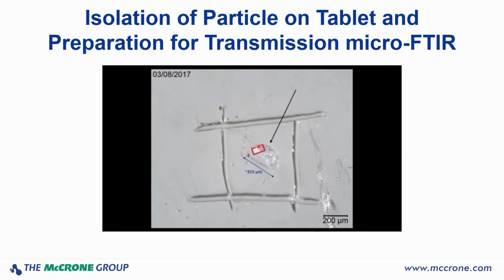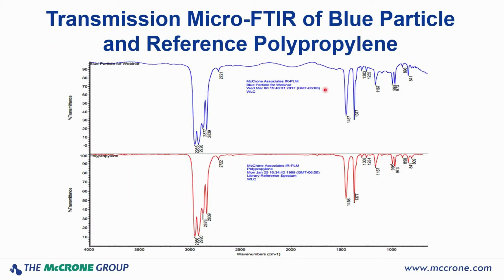And in fact, in our next slide, the blue is the spectrum of that exact particle that I ran, and the red at the bottom is the polypropylene library reference sample.